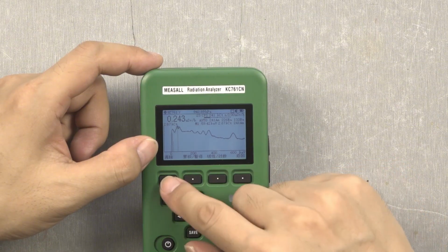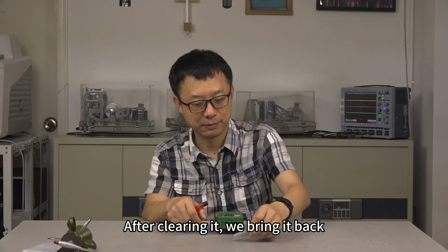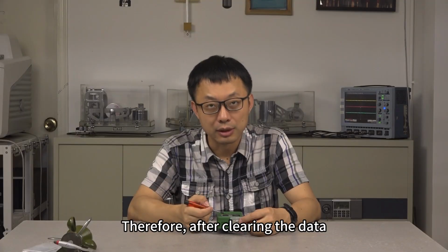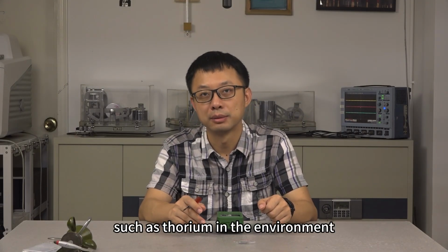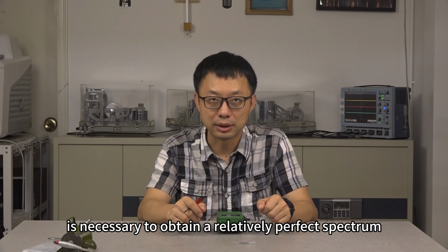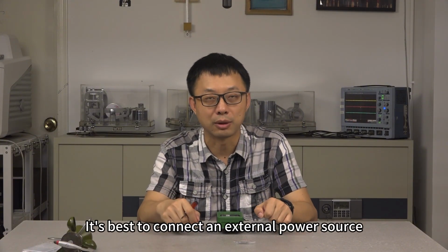Let's demonstrate again what happens when we clear the spectrum for recognition. How about it? After clearing it, we bring it back. It identified americium-241 in under 5 seconds total. Therefore, after clearing the data, for nuclides with relatively concentrated energy, the speed will be faster. However, some nuclides have highly dispersed energy, such as thorium in the environment. In such cases, accumulating a very high count number is necessary to obtain a relatively perfect spectrum. The longest wait may exceed 1 day. For situations requiring prolonged waiting, for power supply stability, it's best to connect an external power source.